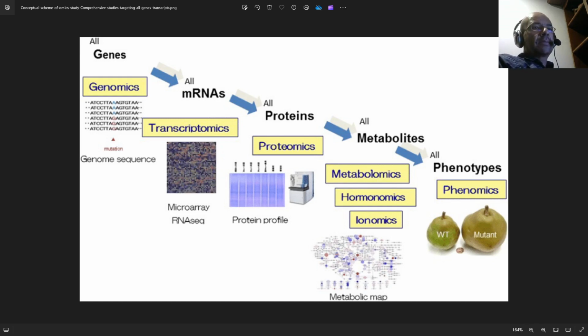Why is differential expression important? It allows researchers to identify genes that play a crucial role in a given sample. These genes act as representatives, revealing valuable insights about the underlying condition or group. In our example, these conditions are: first, mice in different states, pregnant, lactating, and virgin; and second, 147 different samples of a fruit fly, scientifically called Drosophila melanogaster.